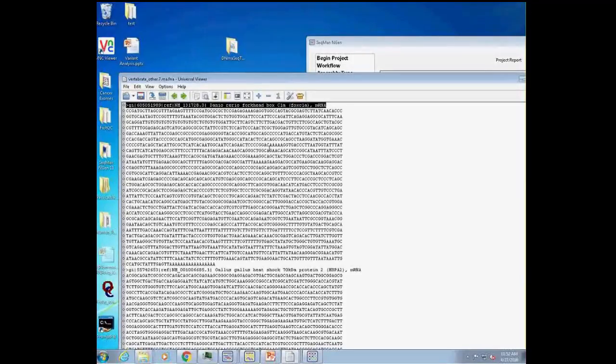Okay, great. And so now the next couple of questions relate to the RNA-Seq side of the workflow. One question was, you showed setting up a reference sequence when you were setting up the RNA-Seq project. Do users have to download anything there, or where do those reference sequences come from?